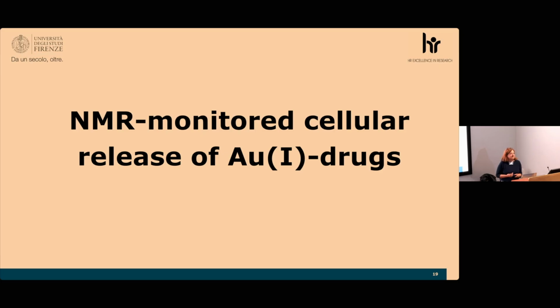We wanted something more at the level of mechanism of action. So we treat cells with these bioconjugates, to see at which level the drug is released to its intracellular targets, when the protein bioconjugate is disassembled.